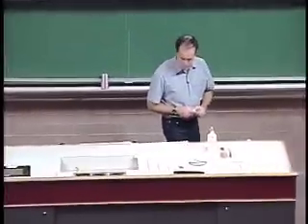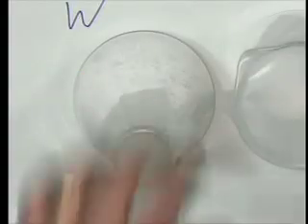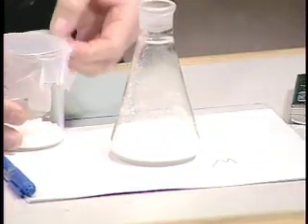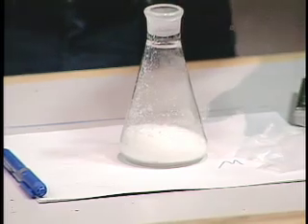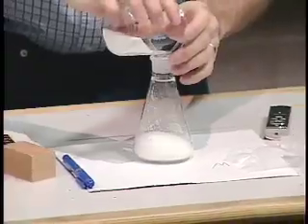I brought some barium hydroxide octahydrate and some ammonium nitrate, and I'm going to combine them. That must be the barium—it doesn't smell. Ammonium compounds smell. They're both white solids, powdery. There's the ammonium nitrate and there's the barium hydroxide, and I'm going to mix these two together.